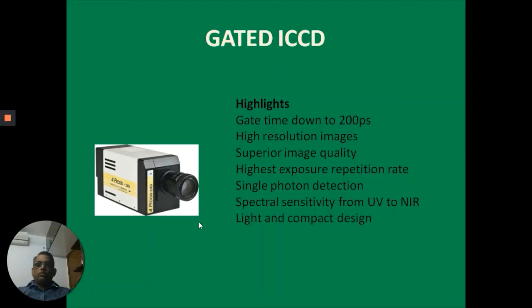So to summarize what we have discussed today, we have discussed the different light sources covering the mercury and xenon lamps, details of all these light sources, application of all these light sources, and detectors starting from diodes to the PMT, and to CCDs, PDAs, and ICCDs.